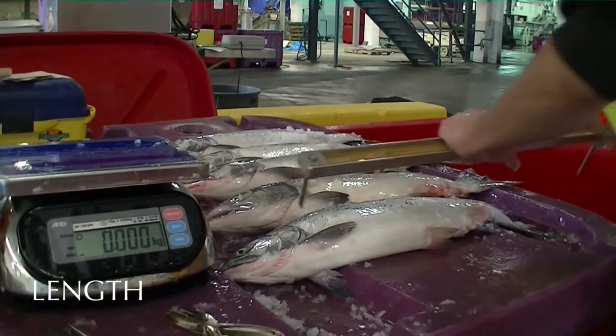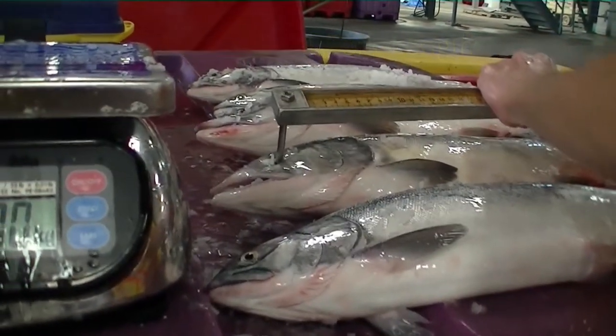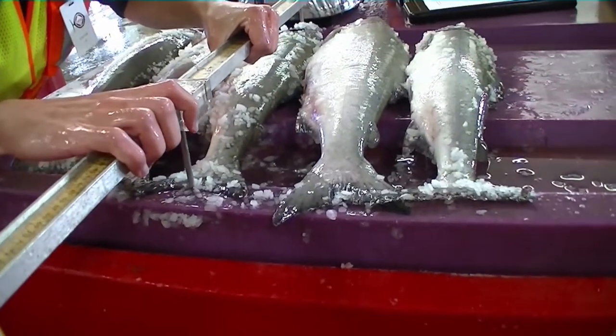Pacific Salmon Commission usually measures length from the rear of the eye socket to the fork in the caudal fin, which is known as the post-orbital fork length. Lengths should be recorded to the nearest millimeter based on the distance between the two stakes of the measuring stick.